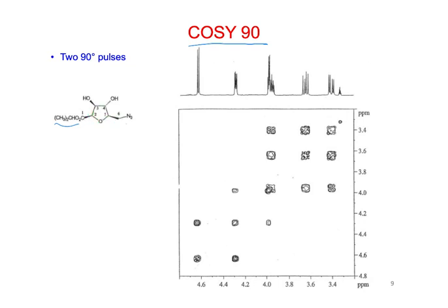Okay? So out of those protons in that spectrum, what we would have to do is pick out some point to start with, right? Pick out some kind of characteristic peak, just by looking at either splitting or chemical shift or something about what we would expect for one of these protons, and then assign it to one of these peaks and work from there.